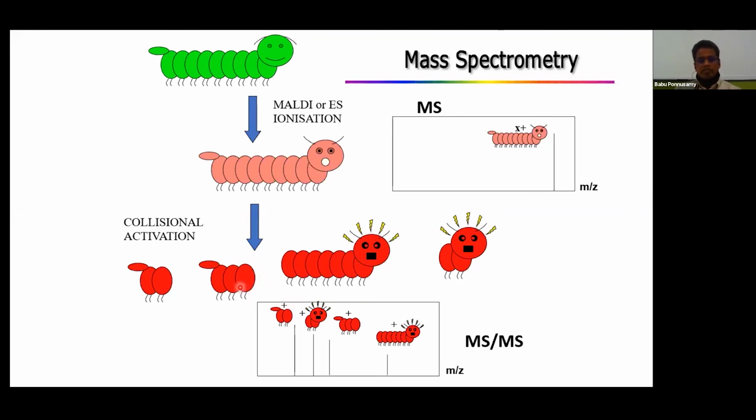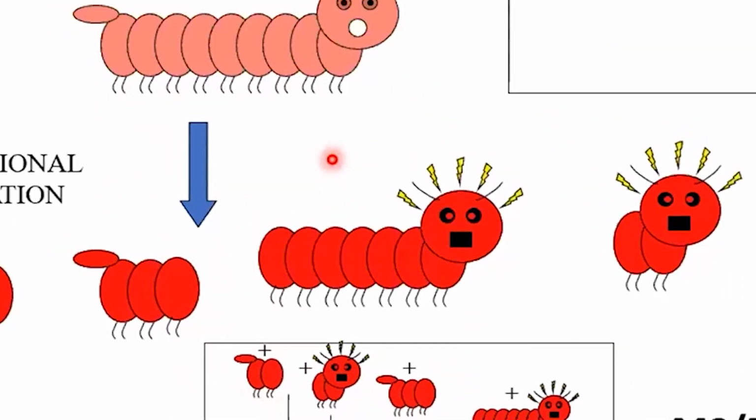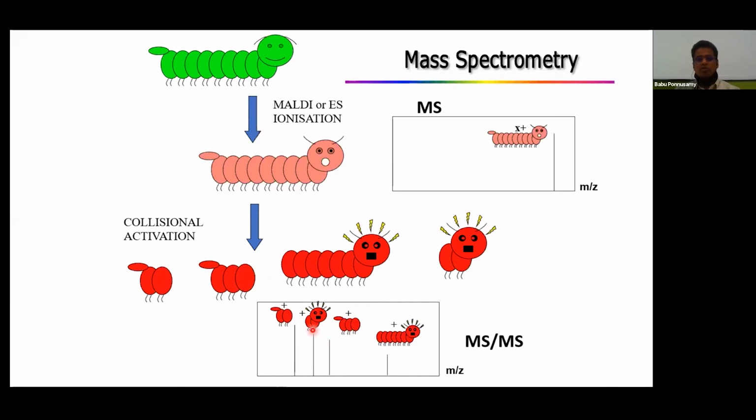Then each of the peptides can be seen in the mass spectrum as obtained. So the way we come up with a sequence of this final molecule is like a puzzle. You have different pieces of a puzzle, and you just need to put them together to make sense of it, and see whether this satisfies all the conditions. Or one can also generate a theoretical MS spectrum and then compare to see whether it matches the expected profile or the expected masses of a peptide or a protein in this case.